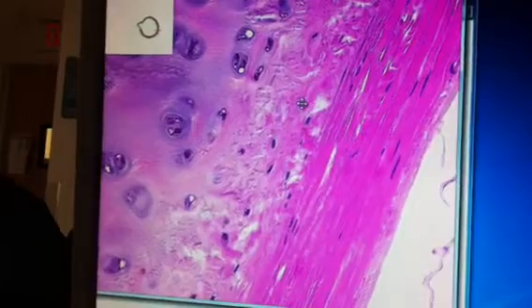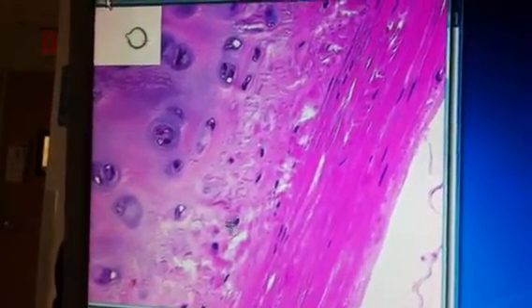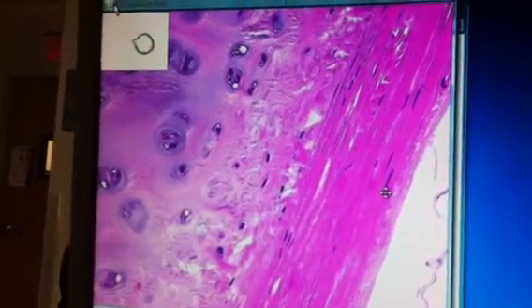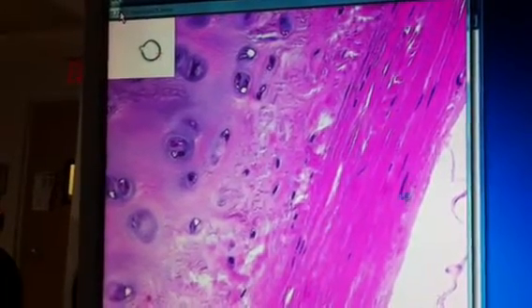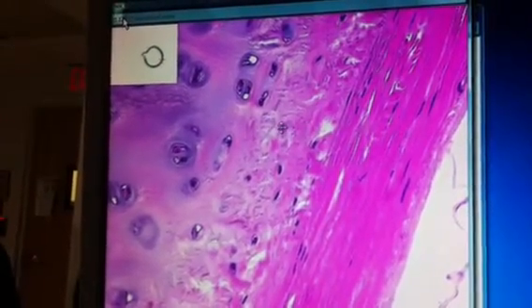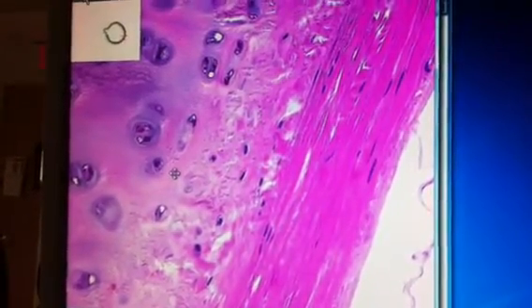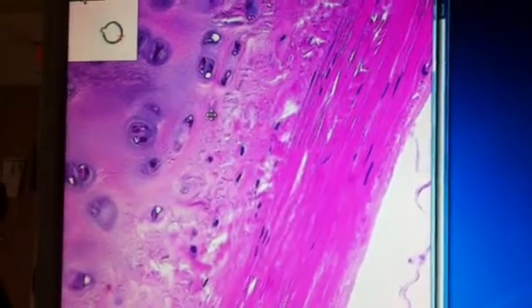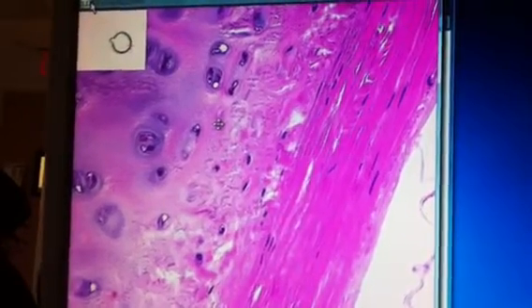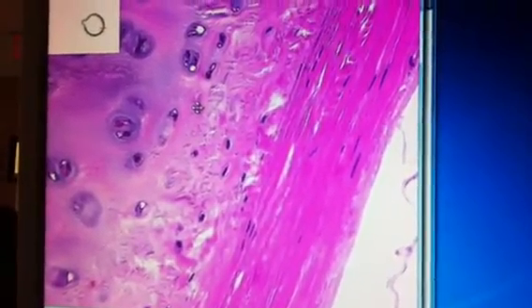Chondroblasts are in lacunae, correct. So you can start seeing the chondroblasts are already sitting in lacunae. If I said then name the cell, what kind of cell is this one? Fibroblasts. Very good. So if I asked you what kinds of growth can this tissue undergo? Both kinds, and I would expect you to name both kinds. Interstitial and appositional.